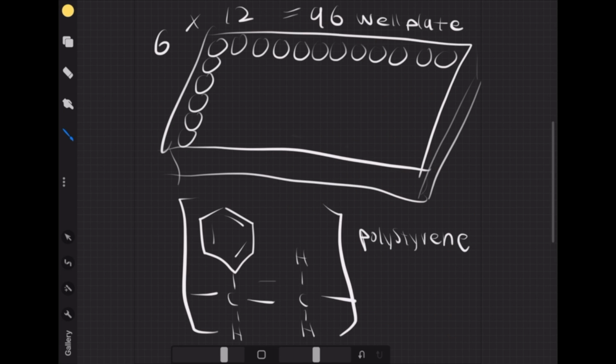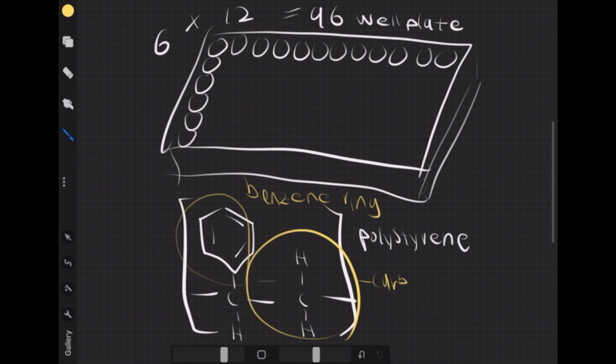A 96-well or 384-well polystyrene microplate is normally used for the assay. Polystyrene is composed of aliphatic carbon chains with intermittent benzene rings, which makes it very hydrophobic. It can form hydrophobic interactions with the nonpolar protein residues and allow the protein sample to passively absorb onto the well walls. The color of the polystyrene microplate is chosen based on the type of signal being detected. For example, clear microplates are used for colorimetric signals.